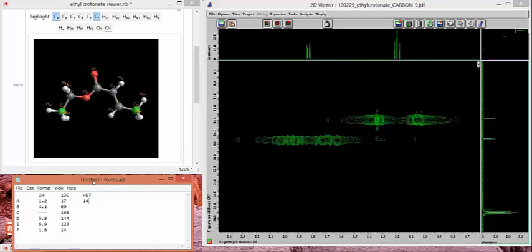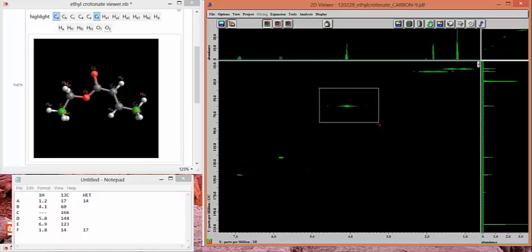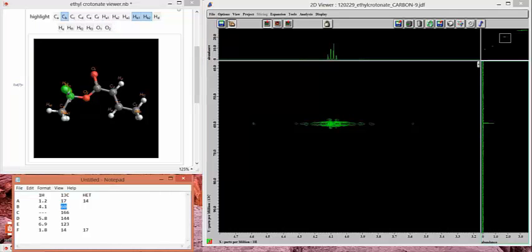So far, I'm 0 for 1 in the interpretation of the carbon spectrum. Actually, I'll be 0 for 2 because that means that if I got that one wrong, then I also got this one here wrong. Let's see if I can do better with the next one. We zoom in to this region here. Originally I said the proton feature at 4.1 is due to B. Let me click that. So that's this CH2 group here, and we would expect that to show up in a region that is around 50 to 70 parts per million, due primarily to the presence of the electronegative atom. I therefore assigned carbon B to the peak at 60 parts per million. Heteronuclear spectroscopy, the 2D experiment, confirms that. Yay, got that one right.